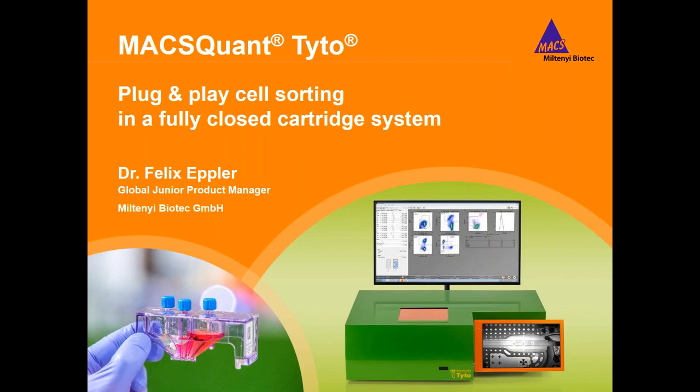Today's webinar will cover an introduction to microvalve-mediated cell sorting and its benefits, with some application examples and the transfer of those examples and applications into clinical settings.